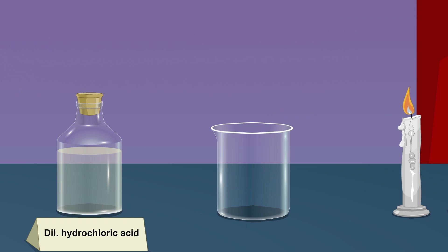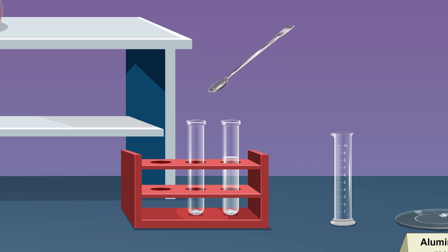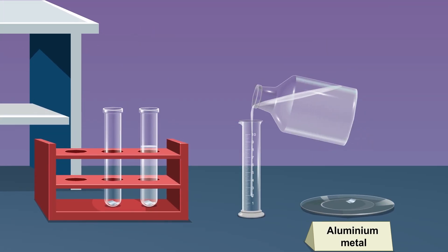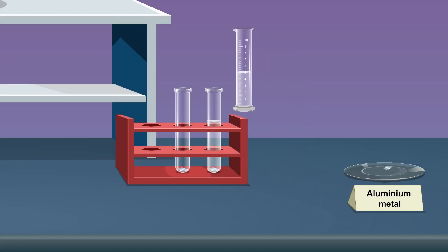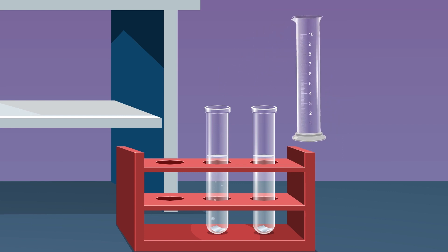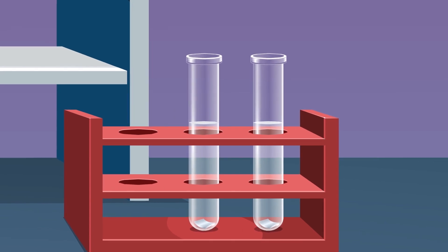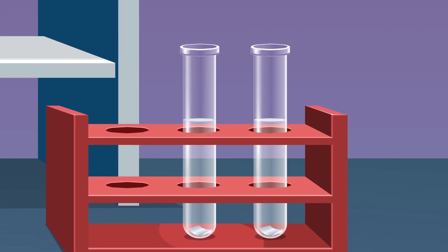Add two pieces of aluminium metal to the next clean and dry test tube using a spatula. Take about 5 ml sodium hydroxide solution in a measuring cylinder and pour it into the test tube containing aluminium metal. Observe the effervescence and colourless gas coming out through the test tube mouth from the reaction mixture.